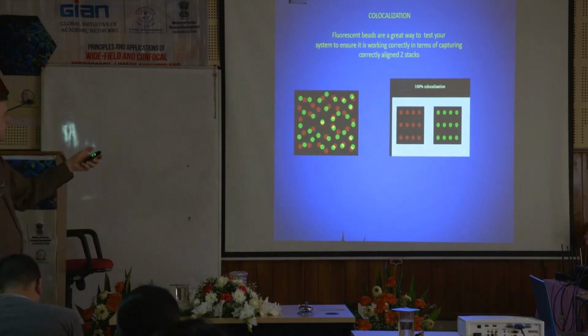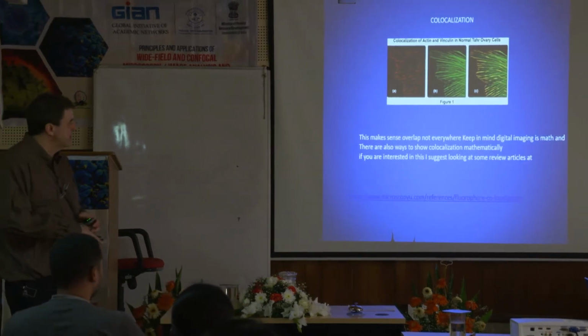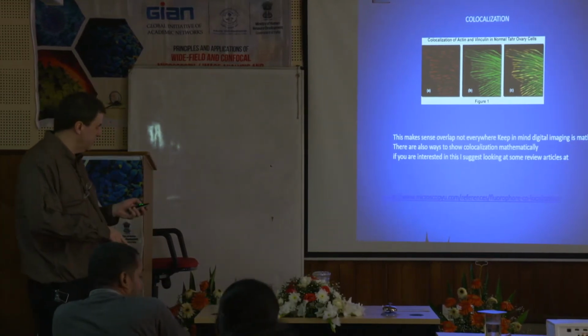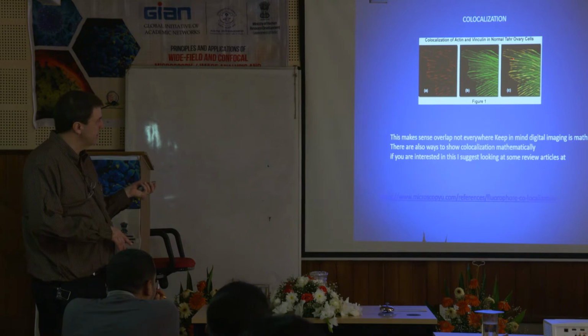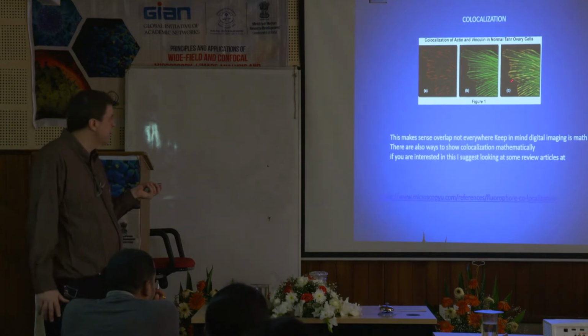Okay, but anyway, it's a good way to make sure that the system's working correctly. Okay, again, you saw this slide yesterday. We talked about co-localization, but here we are again, visiting the topic again. For the most part, you'll see your one color, you'll see your other color, and you'll see some degree of overlap. Okay, same thing in 3D. You'll see some degree of overlap.